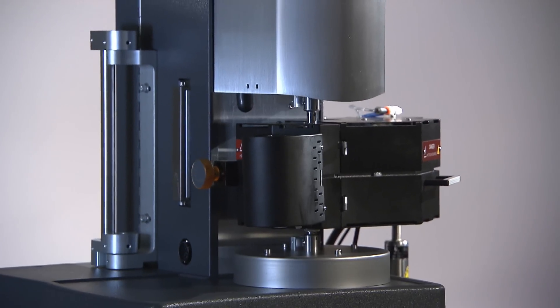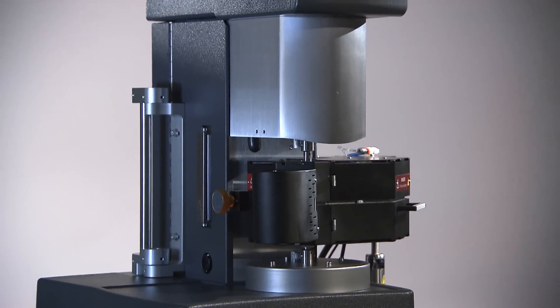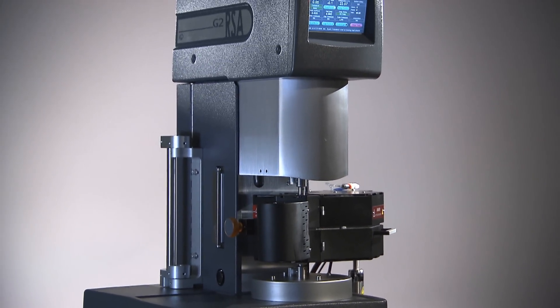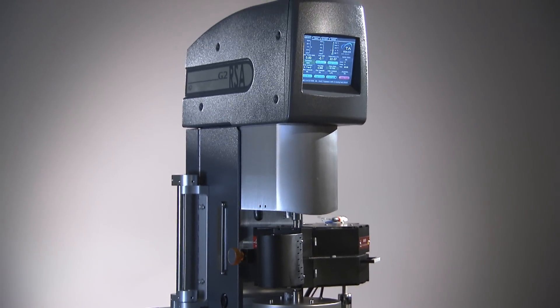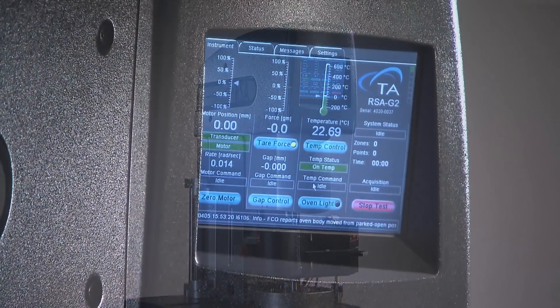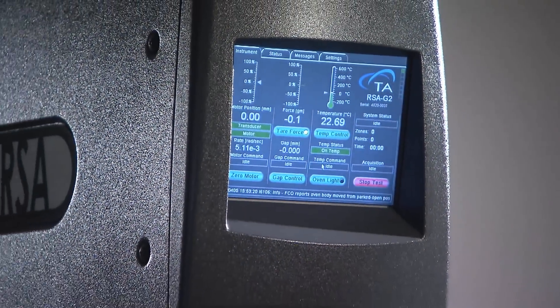With this much testing capability, the RSA-G2 is so much more than just a DMA. It's a complete platform for mechanical analysis of viscoelastic solids.